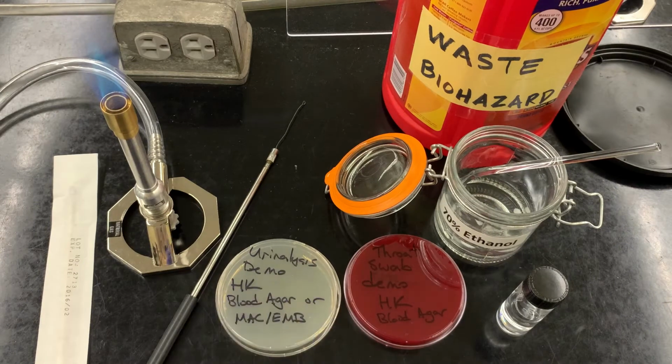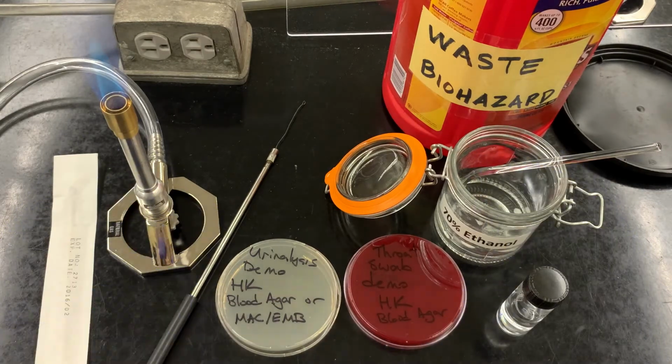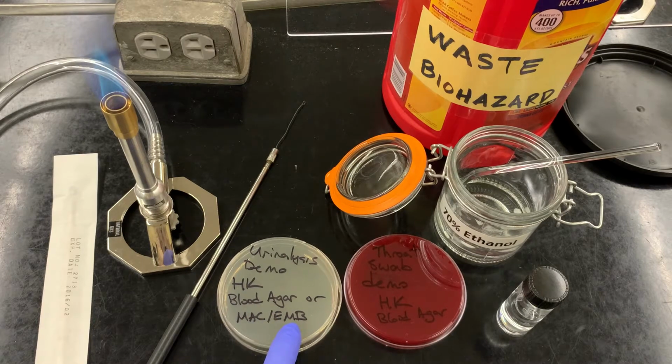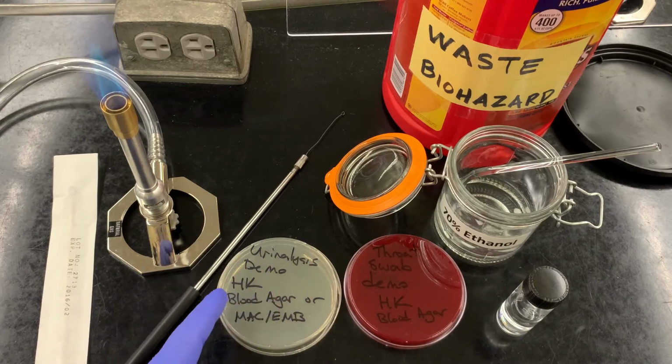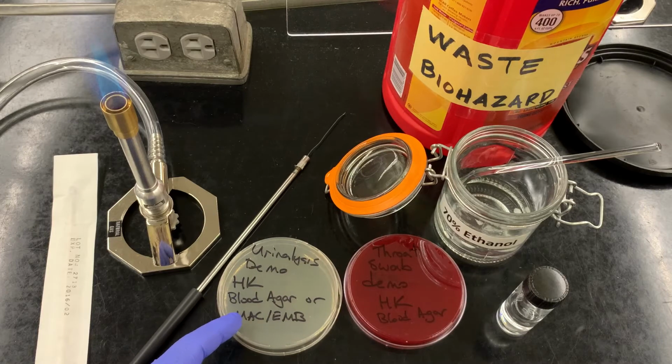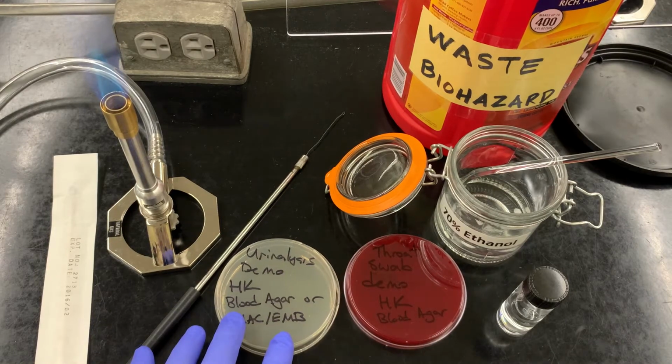The urinalysis is going to require extra medium, so for urinalysis we'll use blood agar or TSA, and then we'll also like to use a MacConkey or an EMB. These, remember, do pretty much the same thing. These media are selective for gram negatives, whereas blood agar is non-selective, right? So through using both blood agar and the MacConkey/EMB, we can actually get a qualitative assessment as to the types of microbes growing. Are they going to be gram positive, gram negative, or do we have a mixture of both gram positives and gram negatives? So we can get that kind of stuff with our urinalysis, and also the ability, hopefully, to quantify, to get the right amounts.